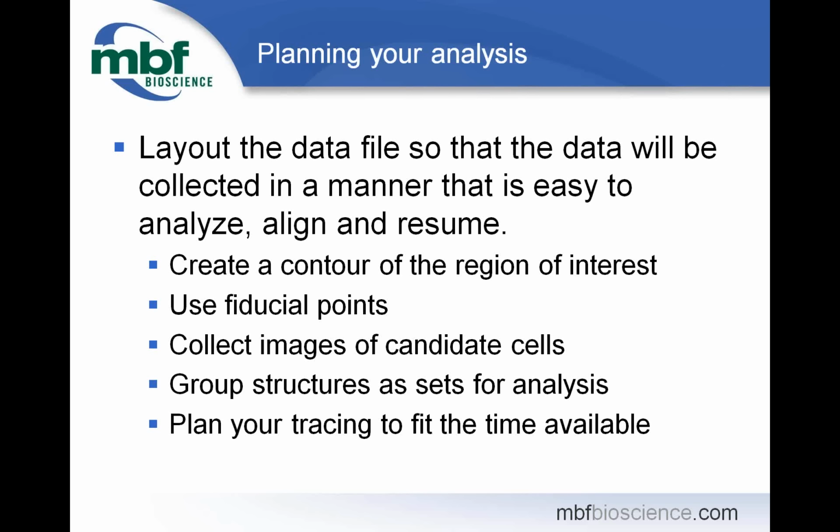And I like to collect images of candidate cells. So as I'm looking at low power, I'll use markers to mark where cells of interest may be. All of these things I'm going to demonstrate, by the way. You'll collect images of these candidate cells as you're going along so that you have a record of cells that you think might be appropriate for analysis.